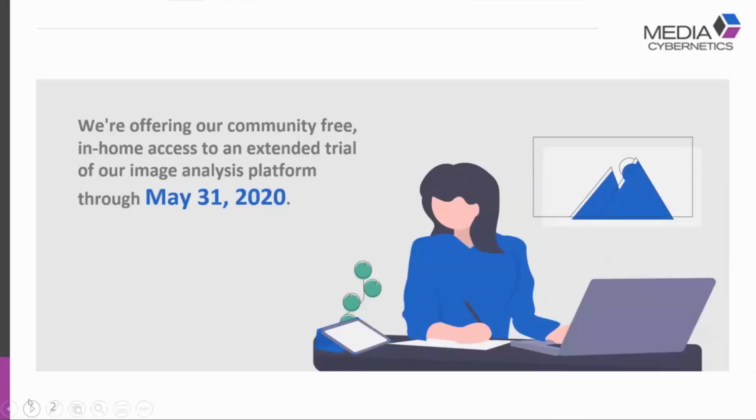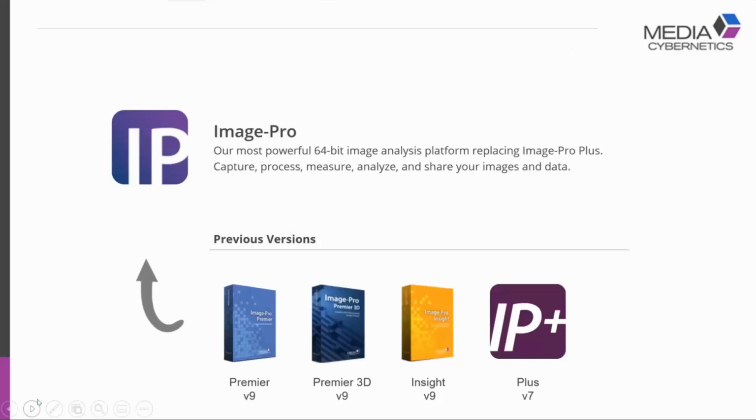Our community of users are always using Image Pro day in and day out in their facilities. However, during this time, while a lot of people are having to work remotely, we want to make sure that the software was still available. So we're providing our flagship analysis platform, Image Pro 10. It offers a myriad of resources available to you and anybody who's using Image Pro through this timeline.